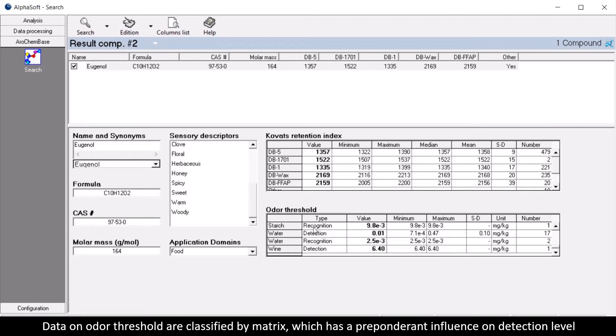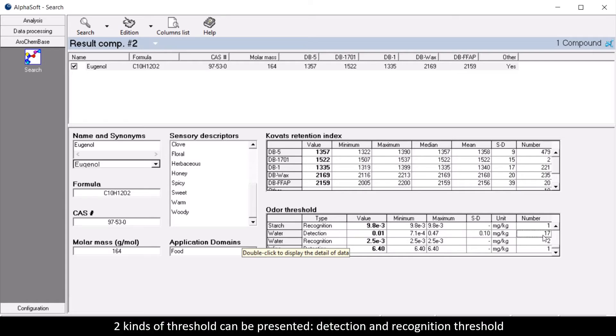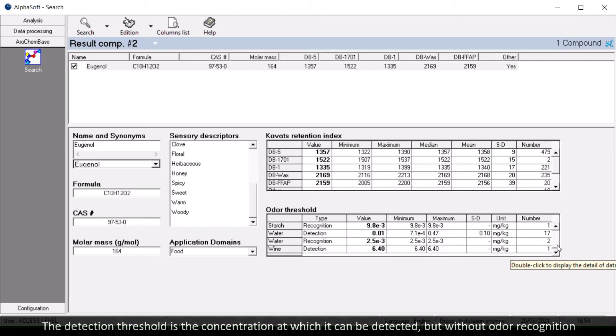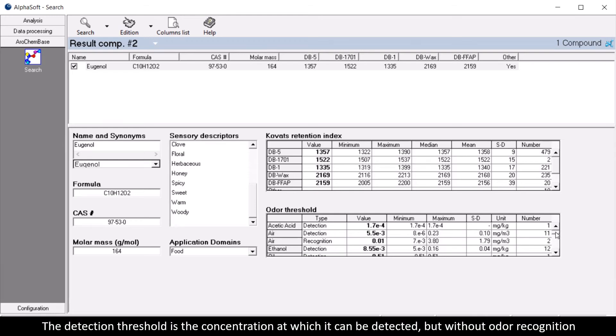Data and odor threshold are classified by matrix, which has a preponderant influence on detection level. Two kinds of threshold can be presented: detection and recognition threshold. The detection threshold is the concentration at which it can be detected, but without odor recognition.